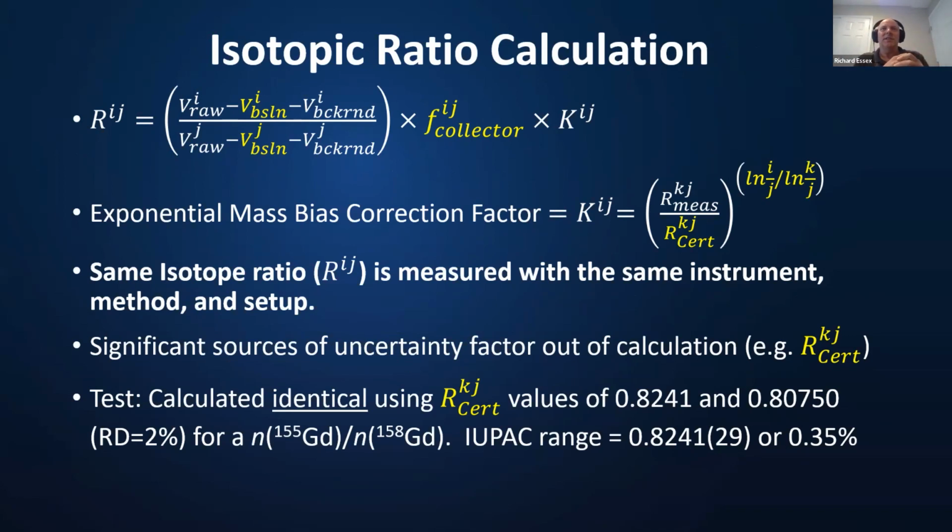for this particular case where you're trying to get at a mass. And to save time, I won't go into this in detail, but just mention that for a lot of isotope ratio measurements, the uncertainty in the isotopic composition of your calibrant can be a major contributor. Well, in this case, that uncertainty completely falls out of your calculation for getting at mass.